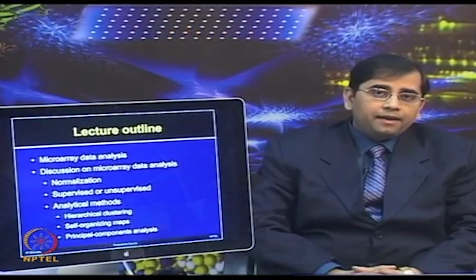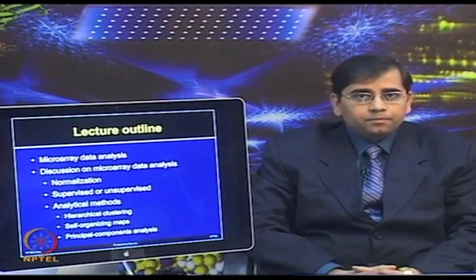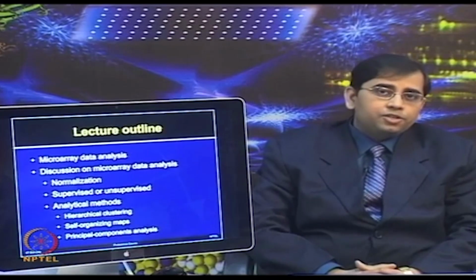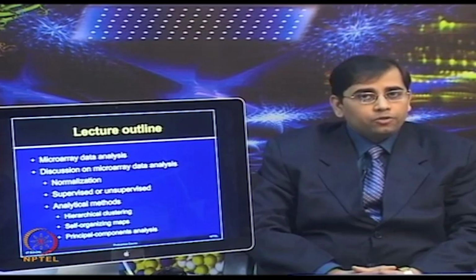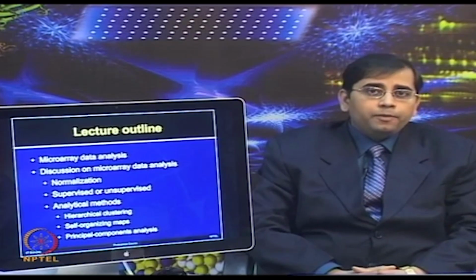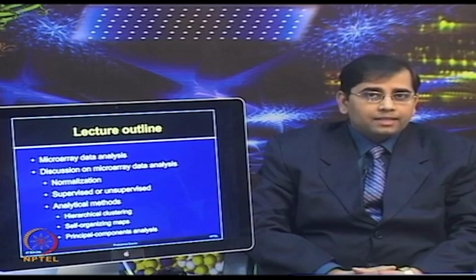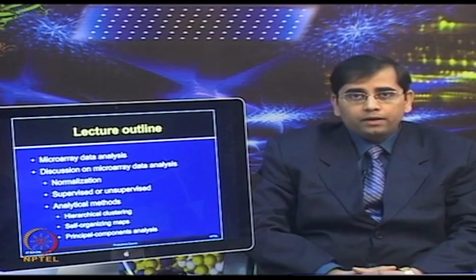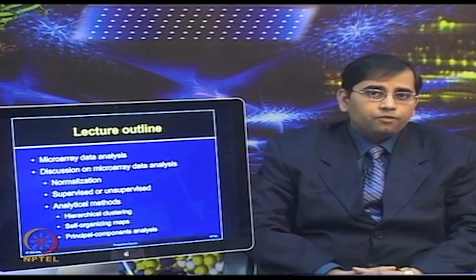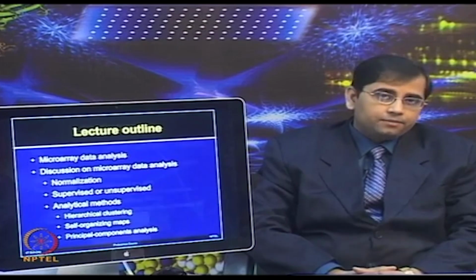To elaborate and clarify the analysis, I will have a discussion with Mr. Pankaj from Spinco Biotechnology. He will be representing Molecular Devices and we will have a discussion on Acuity software to give you a demonstration on the software operation for data analysis.